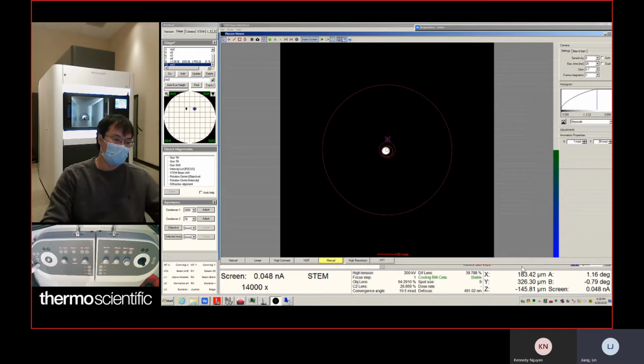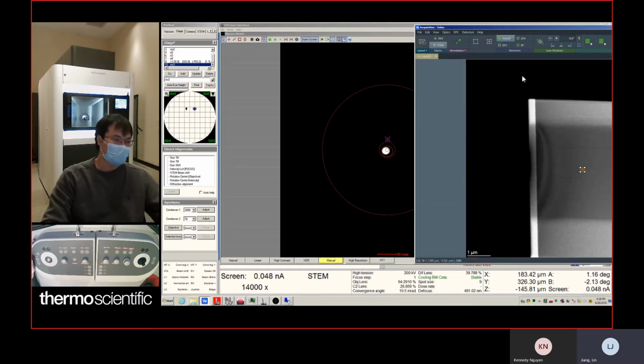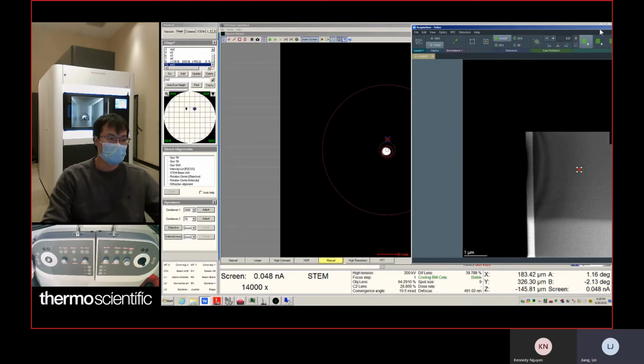You don't care, it's fine. If you lose the sample, lose the Kikuchi pattern, lose the live view, it's fine. You just keep going, because you have some judgment, right? You know it's going to be tilted about 2 degrees, and then we can find the sample back.